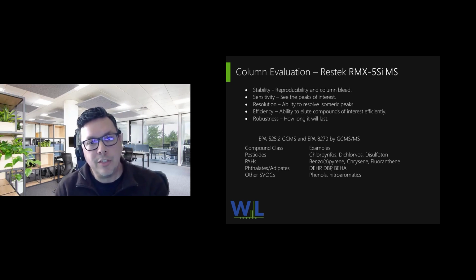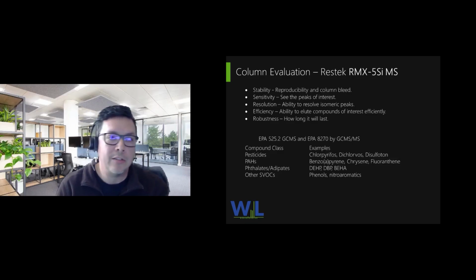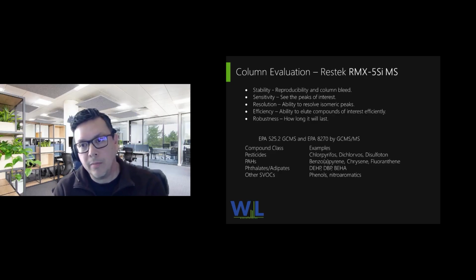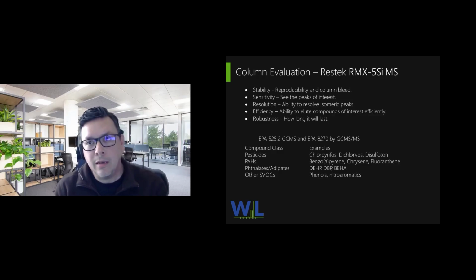And efficiency, I need to be able to do my run in a timely manner, right? I can't run for 2 hours. I need this analysis to be done in 10, 20 minutes. And robustness, how long will it last? Having a column that's great and gives me great sensitivity and great resolution, but only lasts a month, is not efficient for me. They're expensive, and it's troublesome getting a column out of the instrument and back in. It just doesn't work that way for productivity.